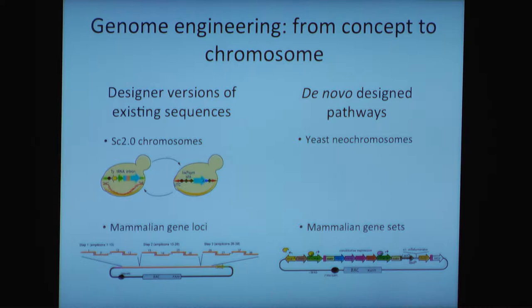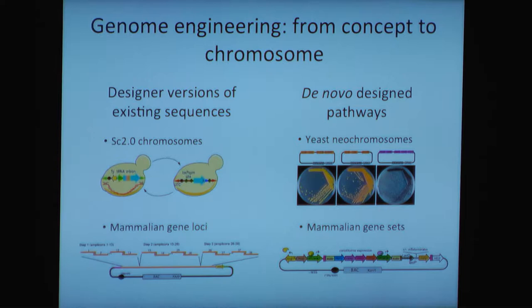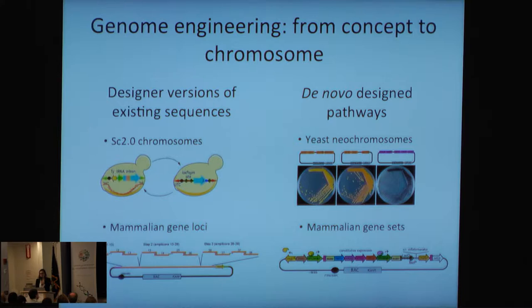We have gone sort of whole hog into building de novo designed chromosomes. And of course, this all has borne out from the SC2 project, where chromosomes are designed and range in length from hundreds of KB up to megabases of DNA and require extensive analysis of yeast colonies to identify those that contain exclusively segments of synthetic DNA and lack the replaced sequences of wild-type DNA.